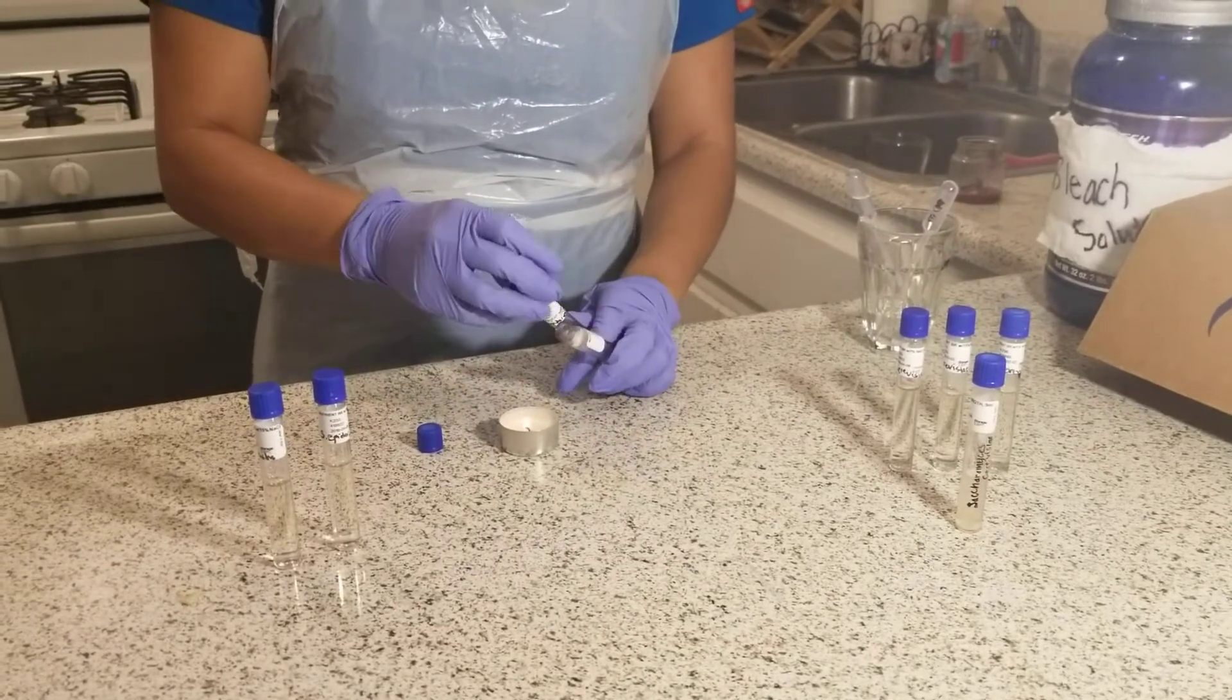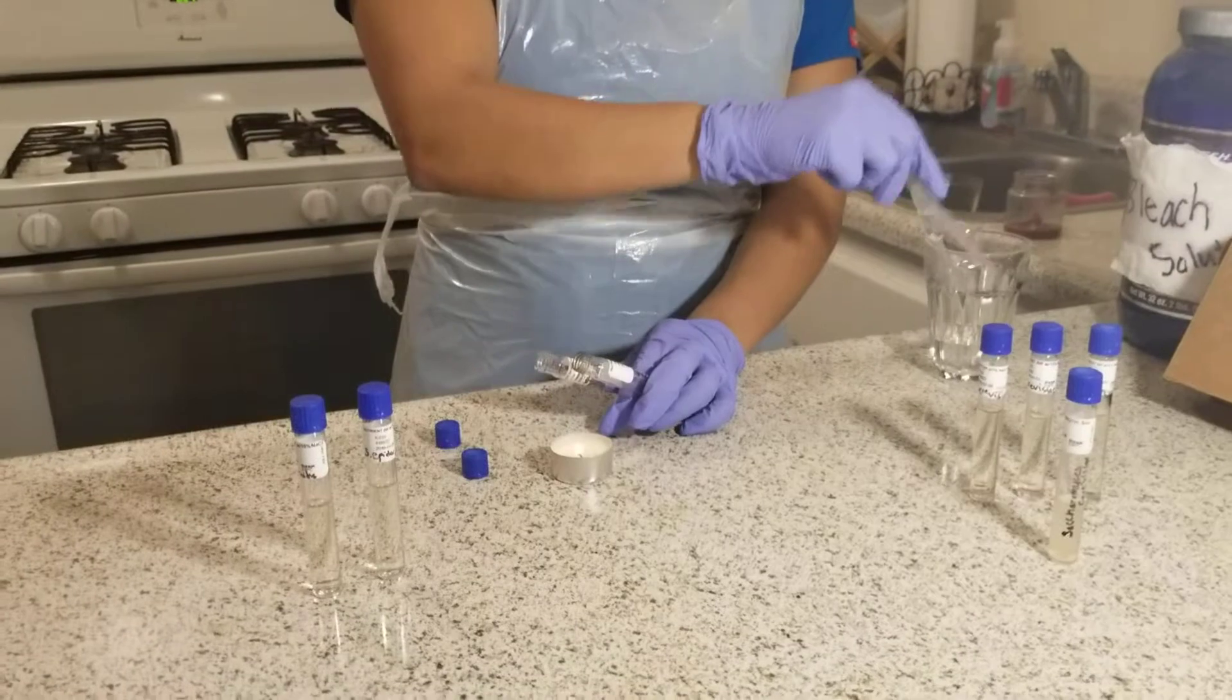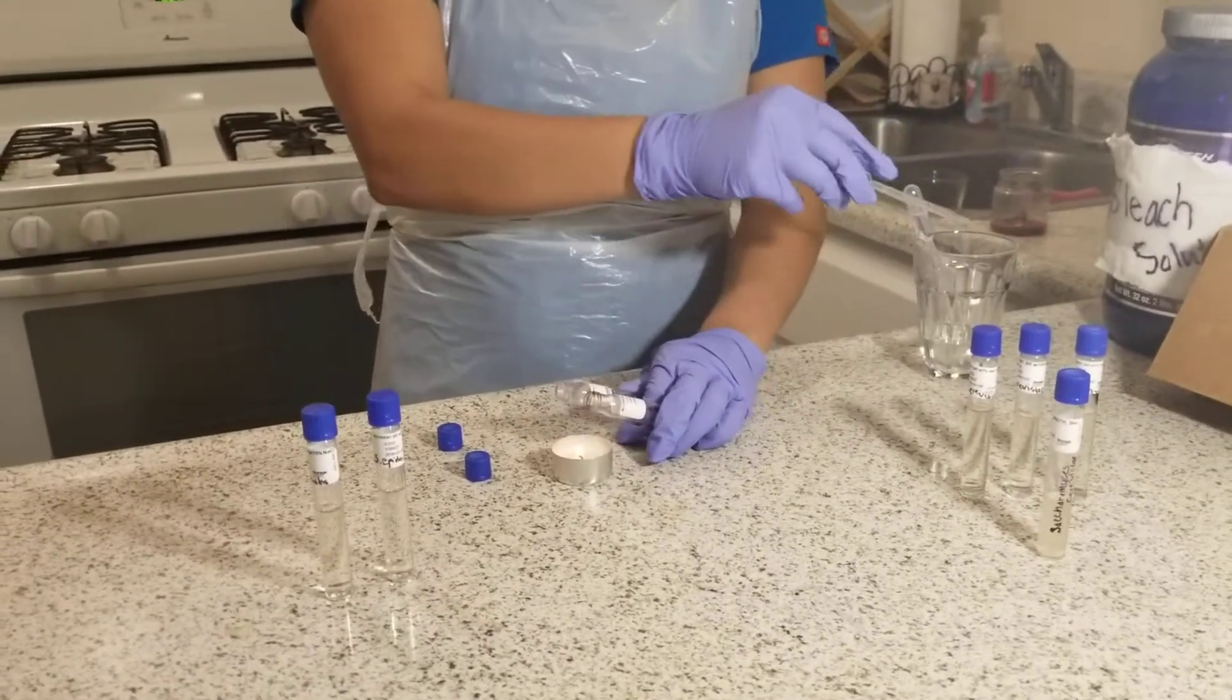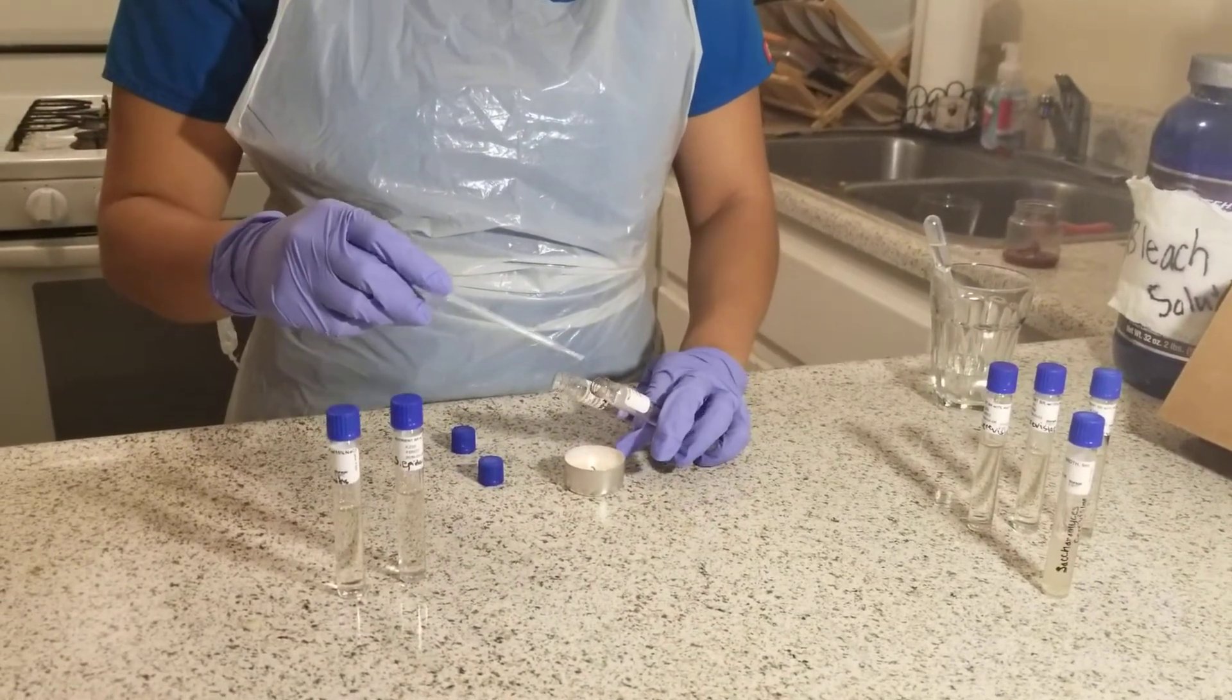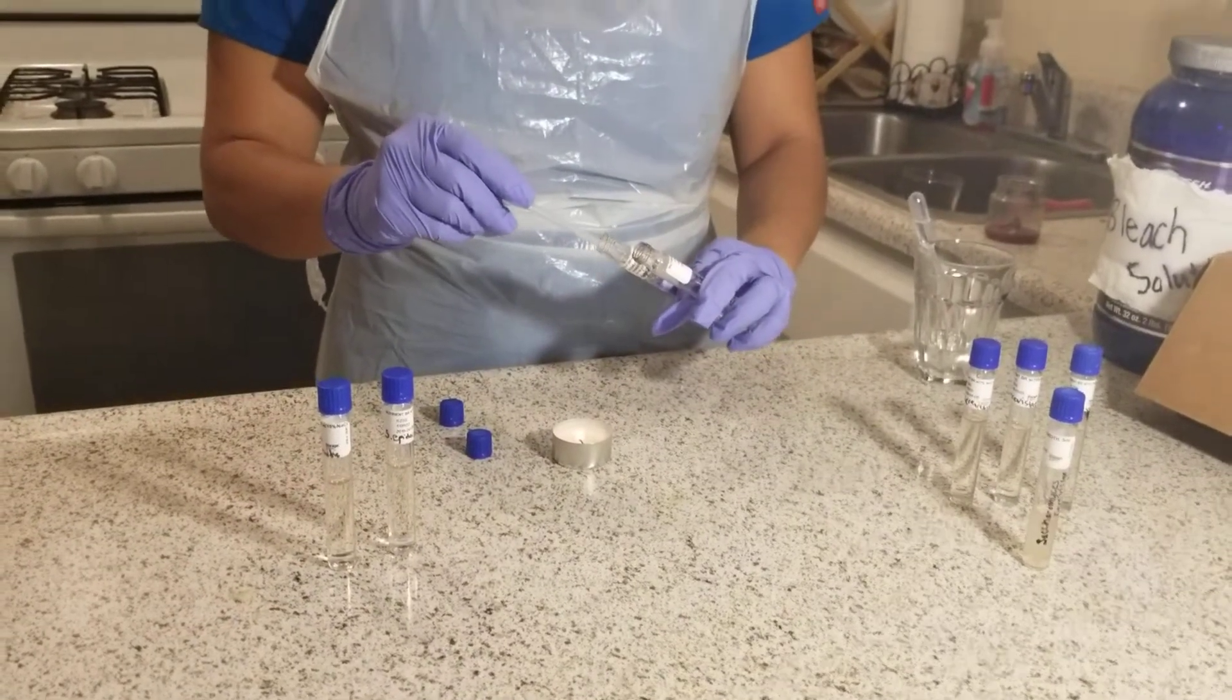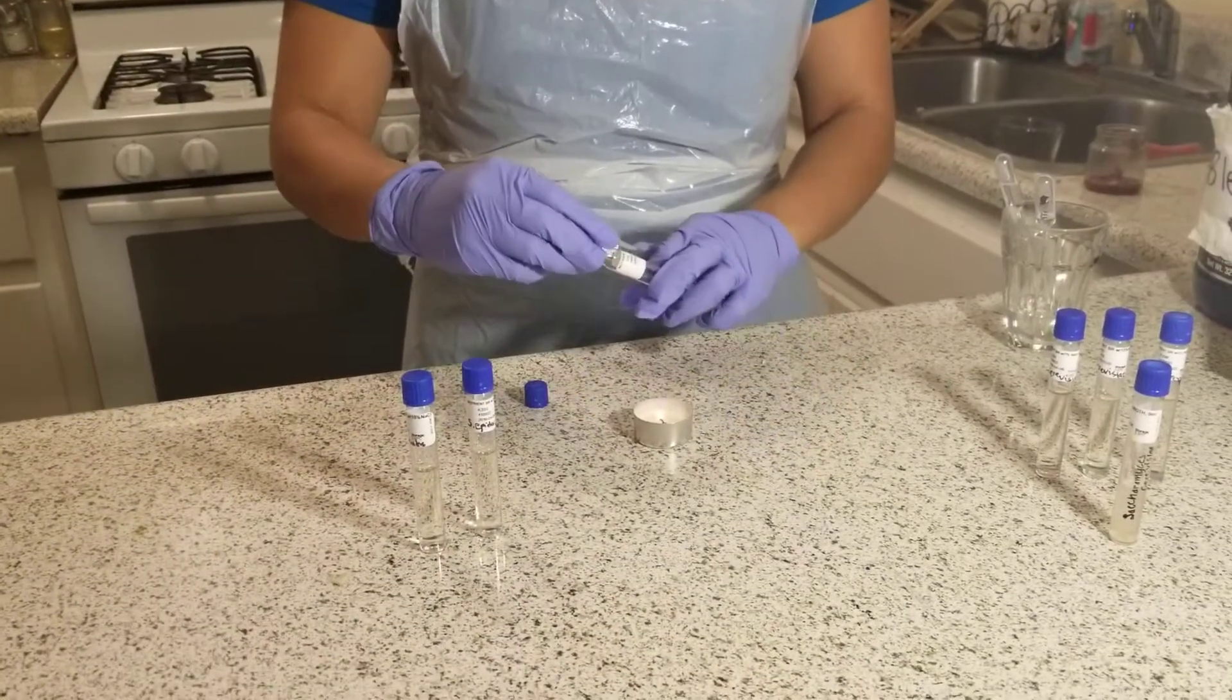I'll take my pipette that's been sitting in alcohol and make sure it's dry. Then I'm going to collect 2 drops from my S. epidermidis broth and transfer them to the sodium chloride solution. Then I'll sterilize the lids of both and recap.